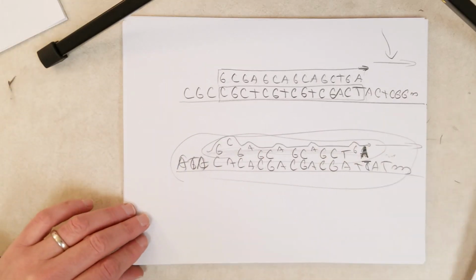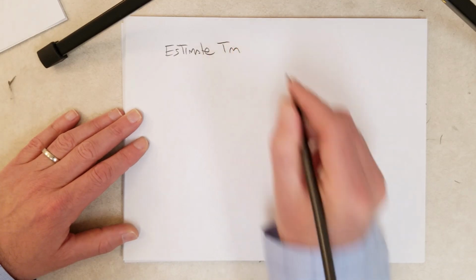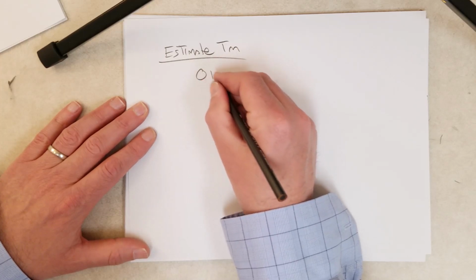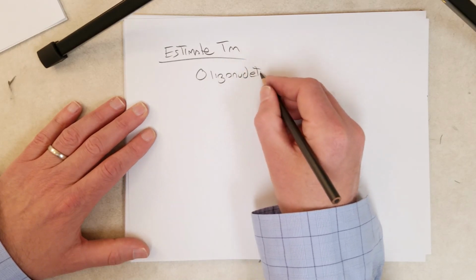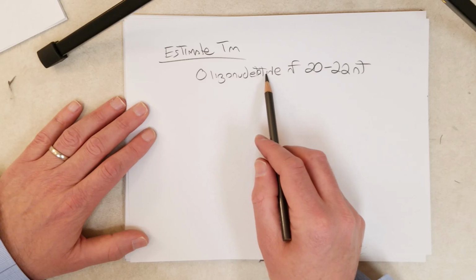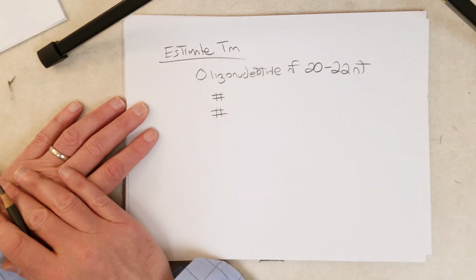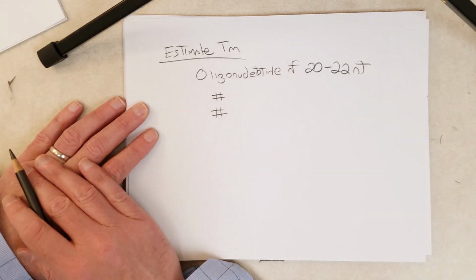Okay, so we have programs that can estimate the melting temperature of a single-stranded DNA primer, but we can estimate it just with this formula here. So estimate TM for an oligonucleotide primer of, let's say, 20 to 22 nucleotides in length. Now, this formula won't give you a good estimate for oligonucleotides that are much longer than this. But it works pretty well for primers that are about this length, and it usually matches what an algorithm from a biotechnology company can predict for you.